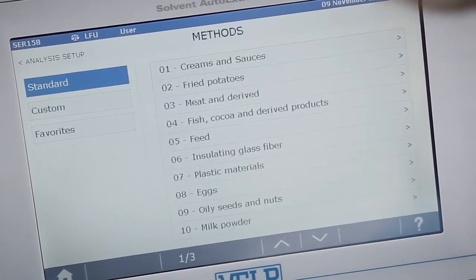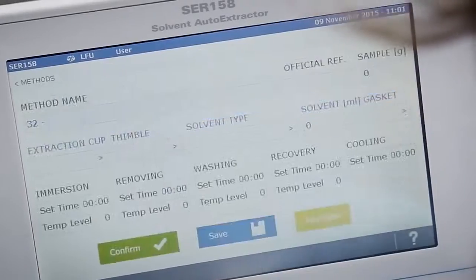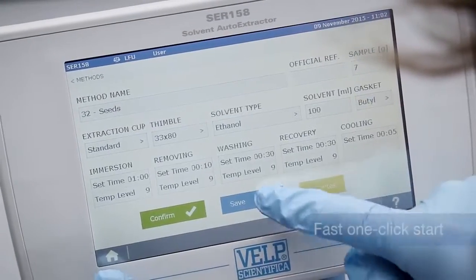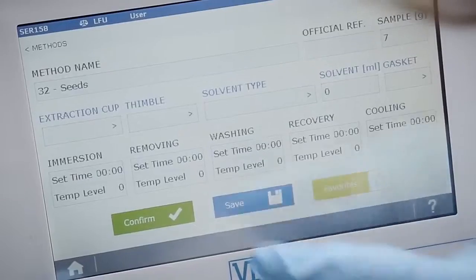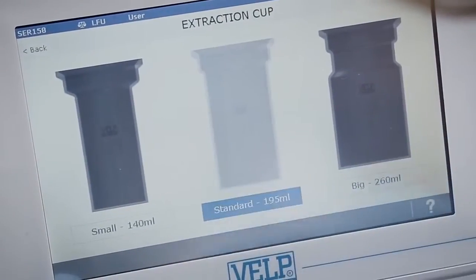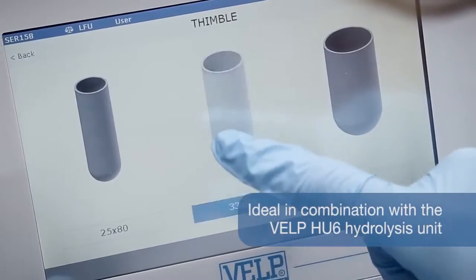Choose from more than 20 standard methods present, create your own and save your favorites for a fast one-click start. Choose from different extraction cups and sized thimbles to optimize consumption and accuracy.